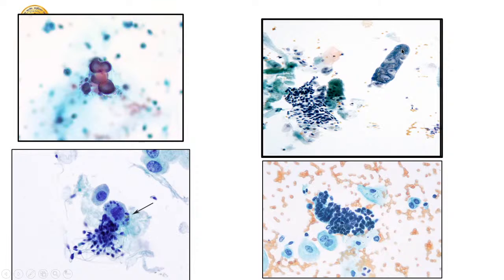This is a renal tubular epithelial cast. And these are some glandular cells possibly. This is from a male. You can see some umbrella cells here. So these are possibly some benign glandular cells. They could not ascertain the origin. Next slide, please.